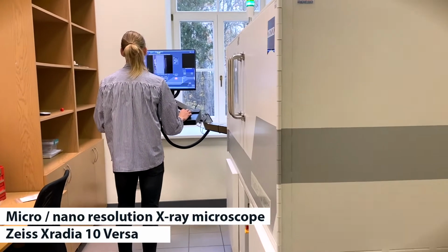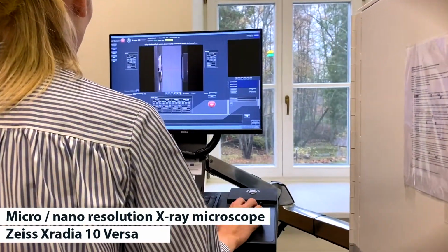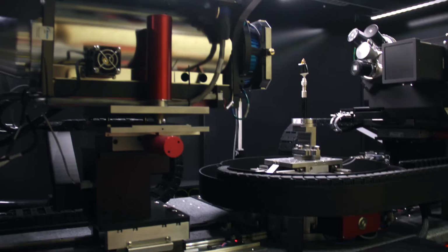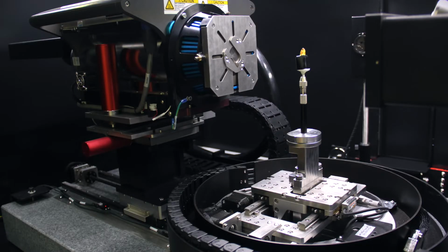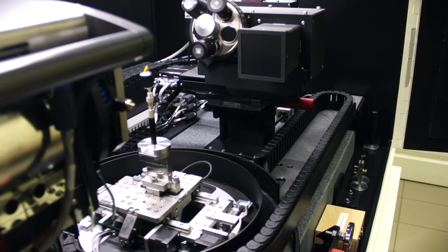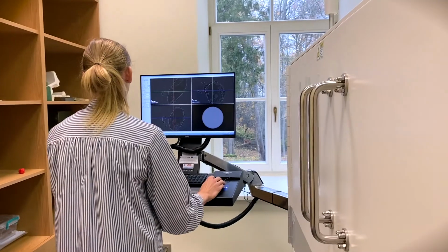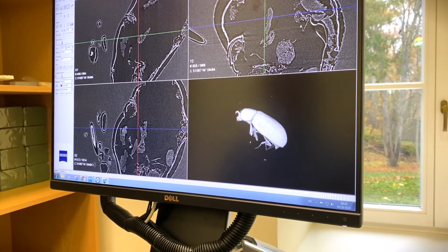The X-ray tomograph is used in the field of biological studies where internal and external structures of biological samples are analyzed. My current research revolves around using an X-ray micro-CT system as a means of non-destructive imaging of 3D samples such as amber and bone. Our researchers are currently working on paleoentomological research, which is one of the most developed research fields in our university. They are collaborating with such institutes as Geological Paleontological Institute, University of Hamburg, Royal Saskatchewan Museum, Senckenberg, German Institute of Entomology.